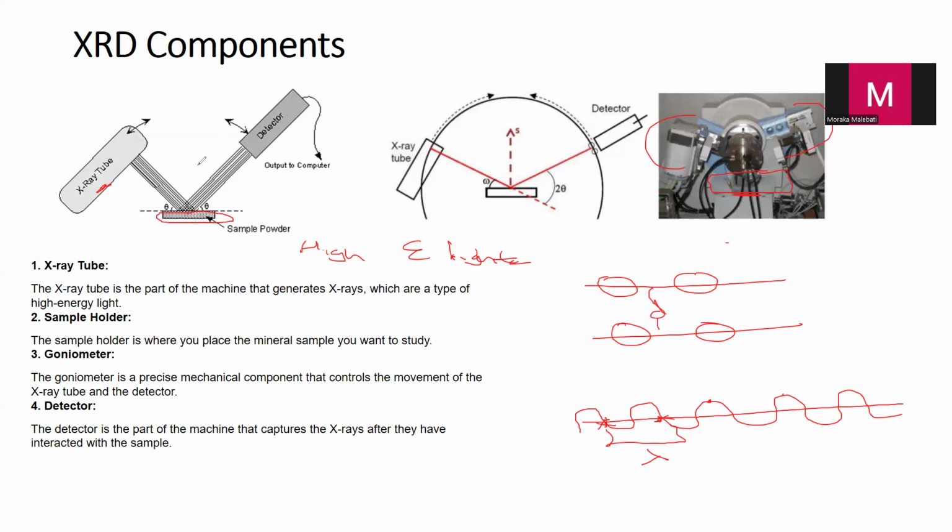When it's at the center, the focused, collimated X-ray beams will shine directly on this sample. The sample is usually in powdered form, which ensures that the X-rays can interact with the crystal from multiple angles. Like I said, if you haven't yet visited the video on X-ray sample preparation of powdered samples, you are more than welcome to do so. We want this sample in powdered form because it allows the X-rays to have good interaction with the crystal from multiple angles.